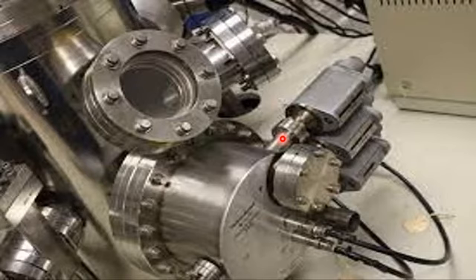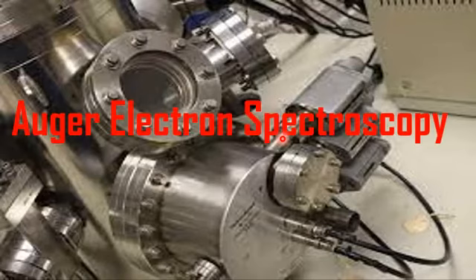So you have understood what kind of techniques may be used on the basis of the interaction, and what kind of analysis may be done on the basis of the emission, transmission, reflection, or absorption of electrons. Now it is quite easy for you to understand Auger electron spectroscopy.